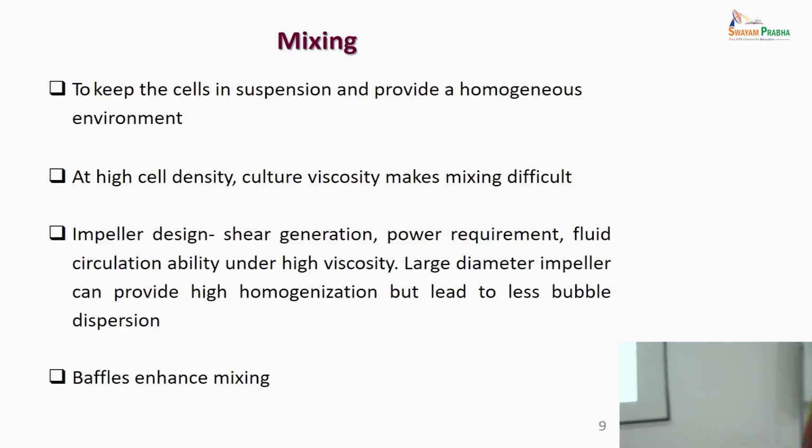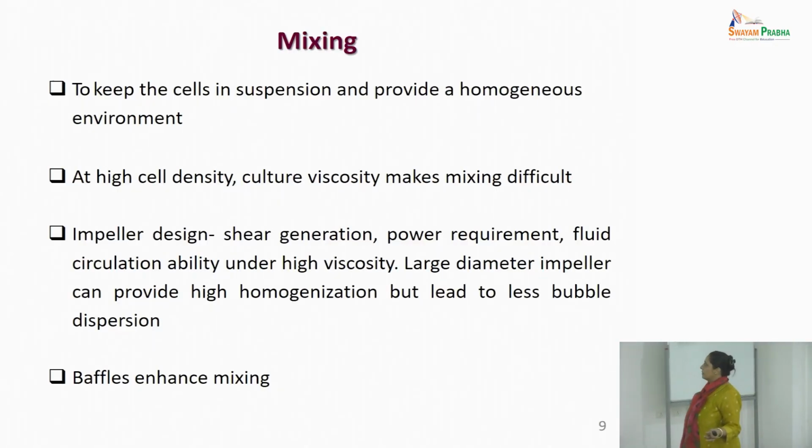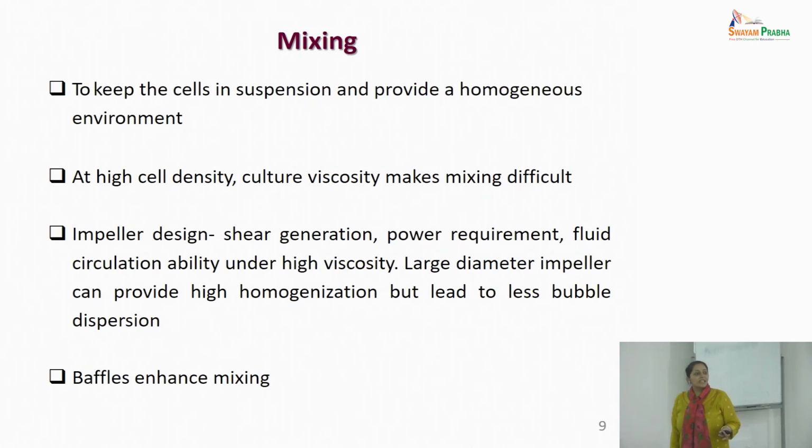So what was the learning lesson? That maybe in the CFD model which we have developed, at the first hand itself, you anticipate this and see how keeping two impellers at a certain distance on the shaft can improve the hydrodynamics, or if through the hybrid model it can, if not improve, at least reproduce the same results as the shake flask. So impeller design and shear generation are responsible for power requirement. So you must take care of the power requirement. Again, it is a cost.